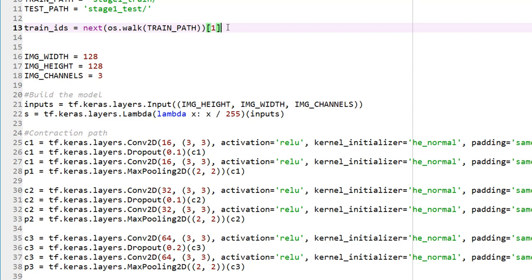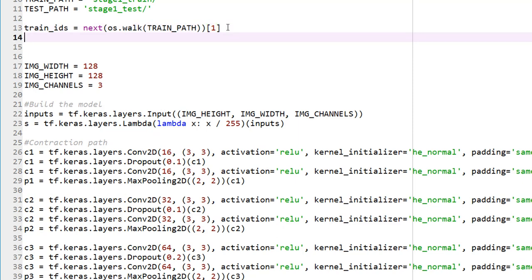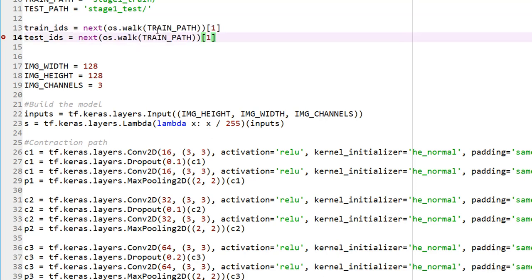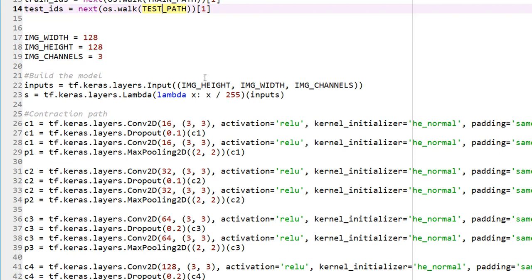This could be confusing if you have never done this before. Please run the code until this point and look at the output to understand exactly what it's doing. Similarly, let's walk through the test folder the same way. So I just got all the training folder names and a list of all the test folder names.